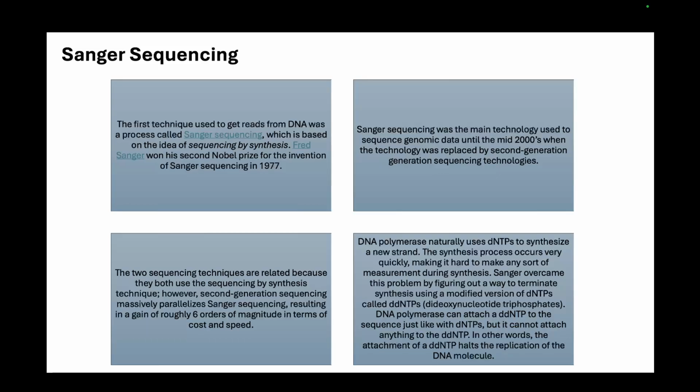It was one of the main technologies used to sequence genomic data until the mid 2000s, when it was replaced by second generation sequencing technology.